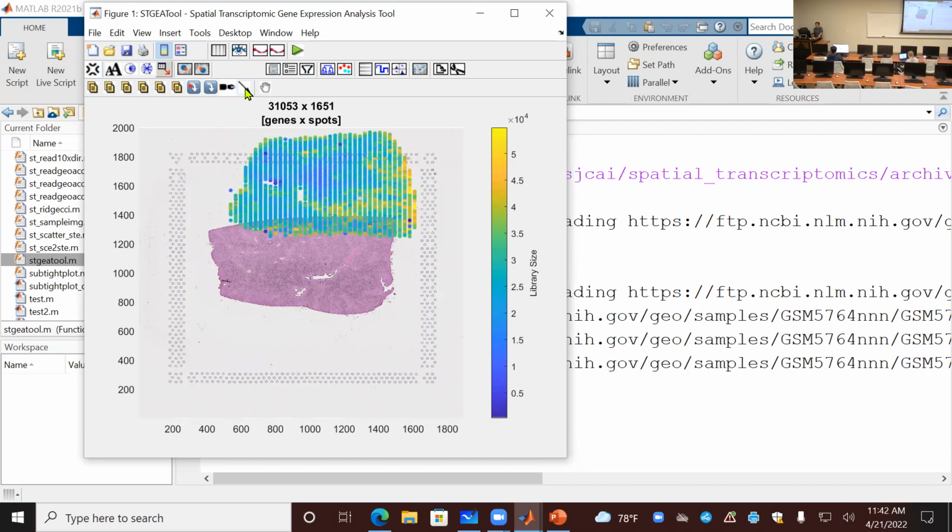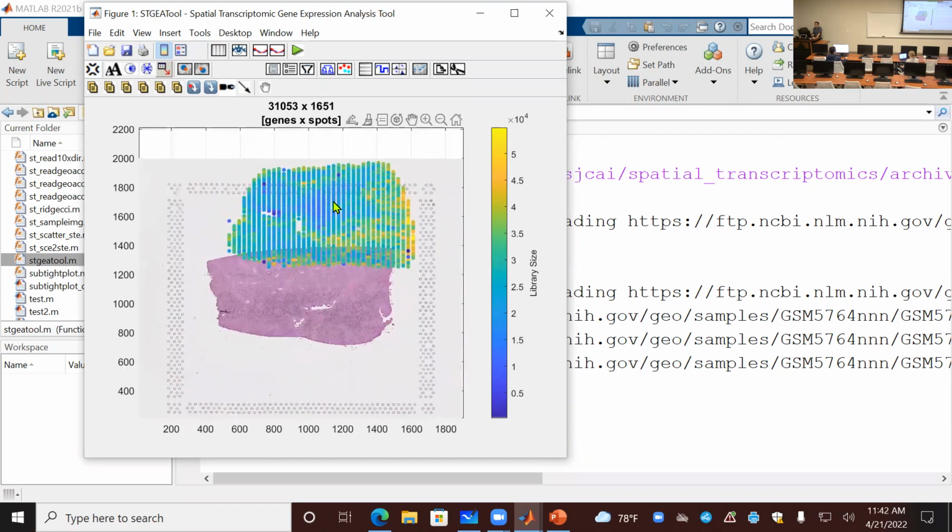But this alignment is important because one of the ways to do the classification for these dots is based on what's the picture under it. So I will do an image analysis by looking at each point, what the image underneath, the small pixel, looks like, and then classify them. So the alignment is important, but in this case, for some reason, I just don't know how to align it.